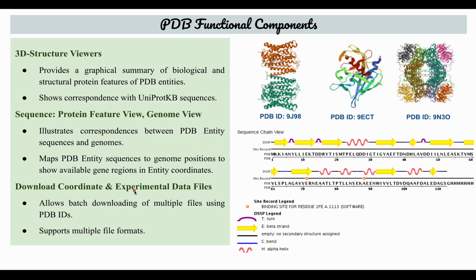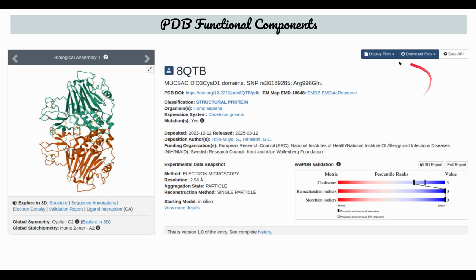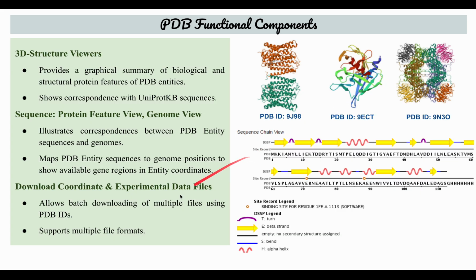And you can also download the coordinates and experimental data files from the PDB. In this, you can download the file from this option. You can download it in PDB format or other formats which are available. So depending on your requirement, you can go for it.